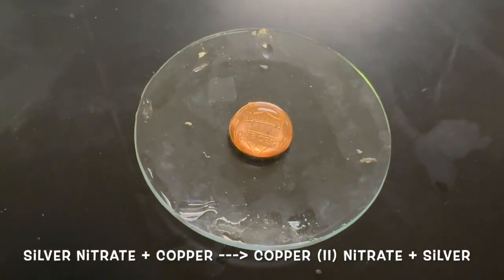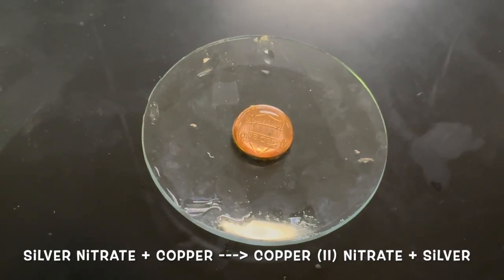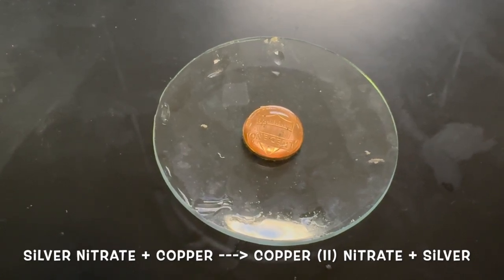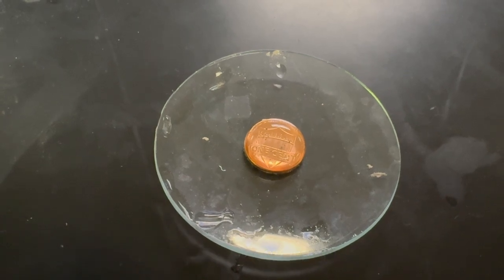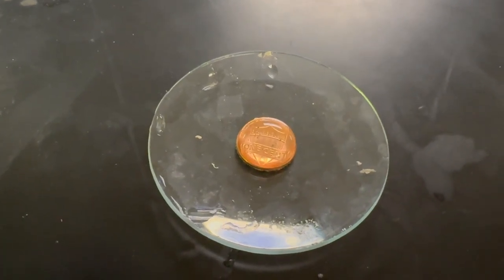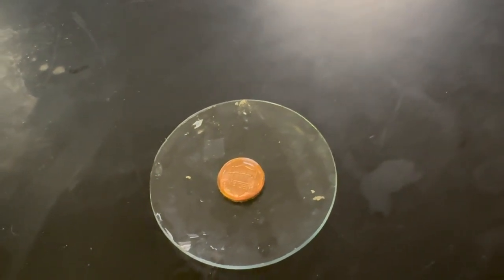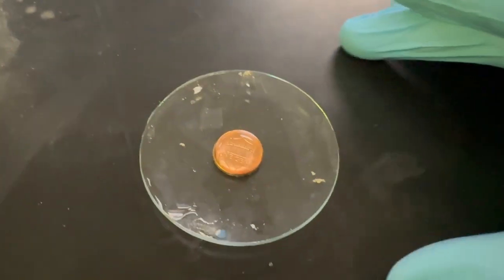So you're going to have 4 different reactions here, and your job is to use the amounts that we will be giving you throughout the lab to start with your given measured quantity and find out the amount of product that you are going to be making. In some cases, you are going to be finding theoretical yield, and in one case, you're actually going to be taking actual yield compared to a theoretical yield for a percent yield.